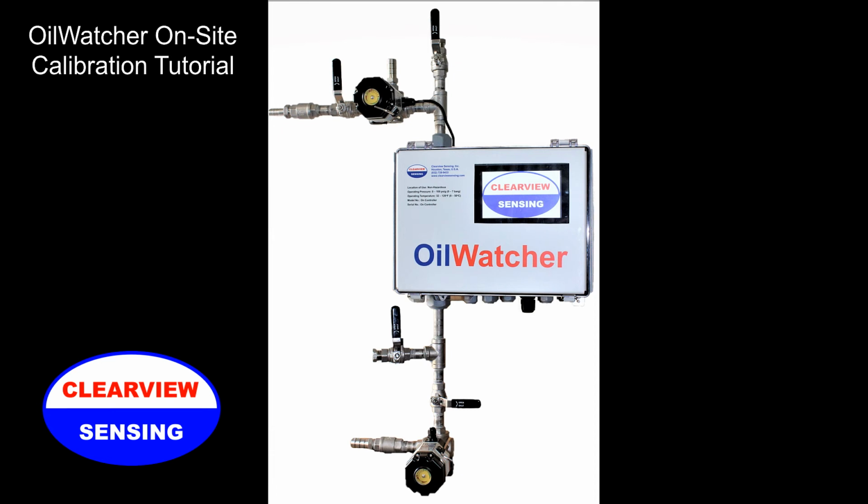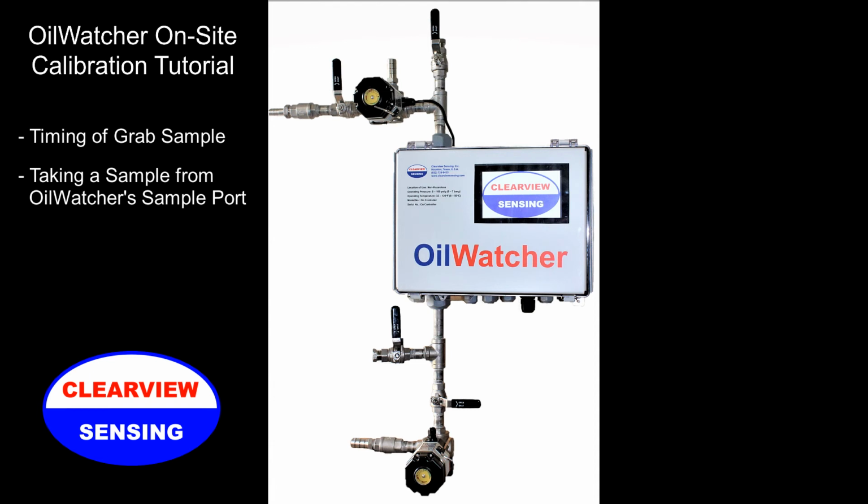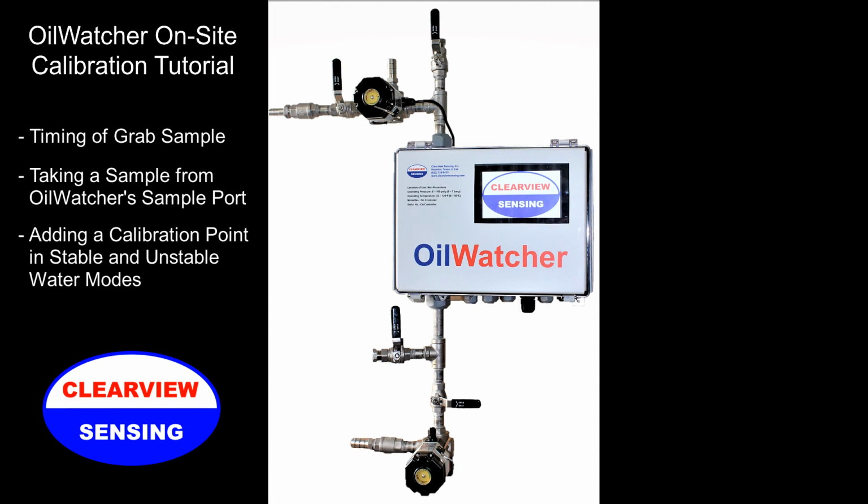Hello. In this tutorial, we'll discuss calibration of OilWatcher after installation and commissioning. We'll take a look at timing of a grab sample, taking a sample from the sample port for analysis, and adding a calibration point in stable and unstable water modes.